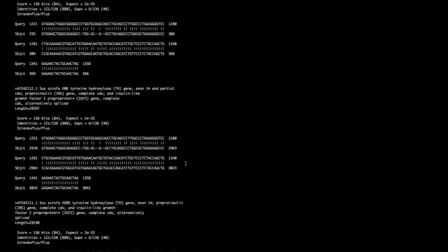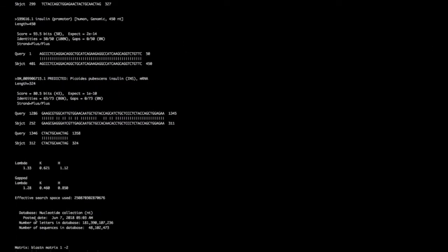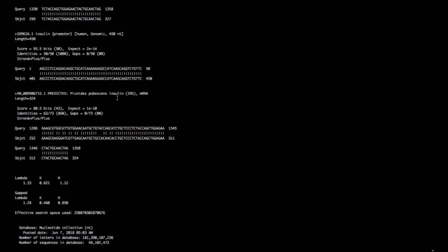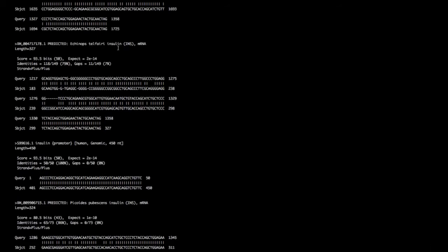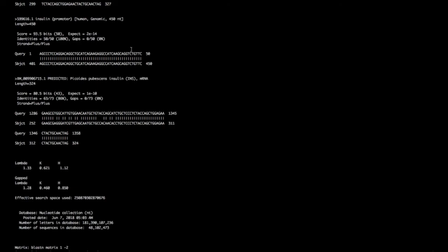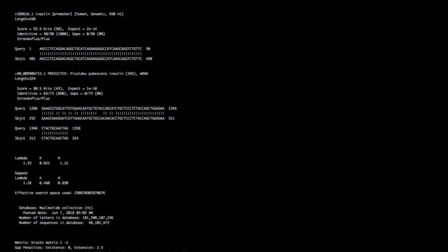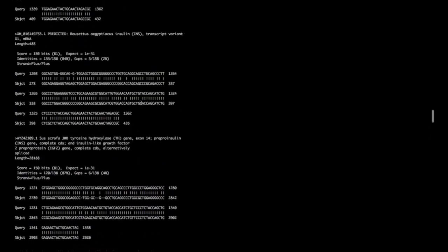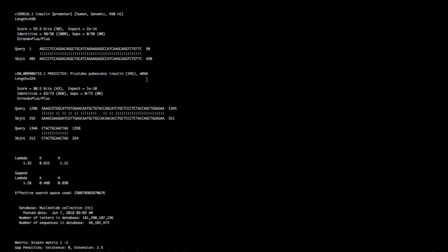We're getting a lot of data. At the bottom we see our worst match — picking up insulin sequences again. If you don't want output streaming to the terminal, just add the -out flag. For example, name the output file 'insulin.out' — then nothing is posted to the terminal; it all funnels into that file. If you have very little space and don't want to make another file, you can also skip the -out option.